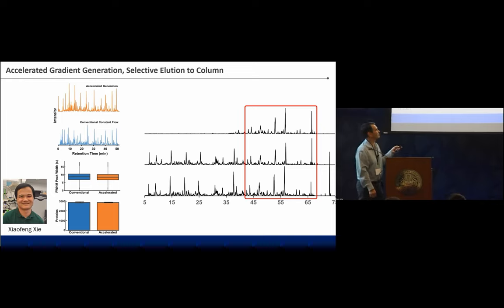Any search engine, Proteome Discoverer, MaxQuant, FragPipe, any search engine that can be accessed by command line can work really well with this. And so we can send it to multiple. First of all, we can automatically handle our data storage, right? Data management. We can say, okay, delete this right away or keep this, and send our data to multiple on-site and off-site locations. He calls these workers. So maybe different computers are doing the heavy lifting of running the search, and they can all be working in parallel, just taking the queue and chomping through it.